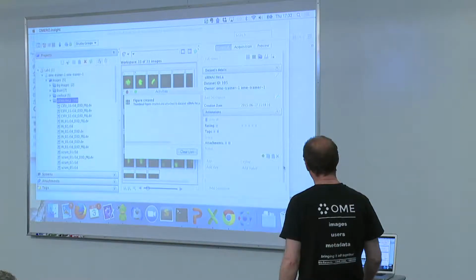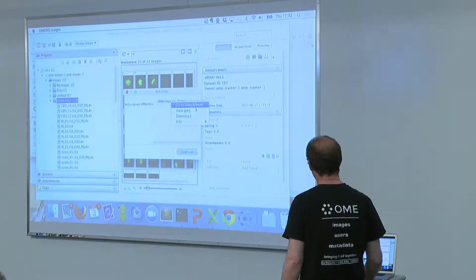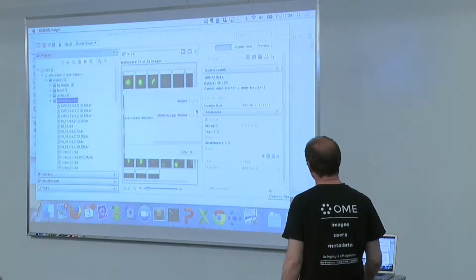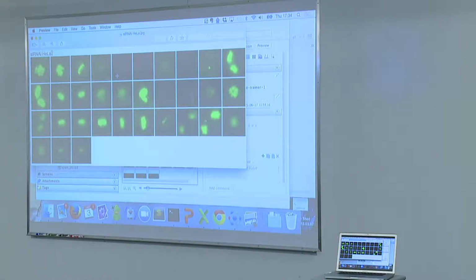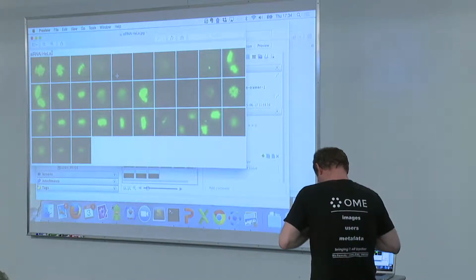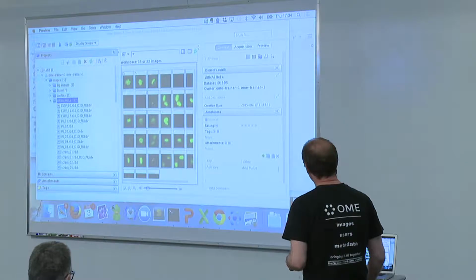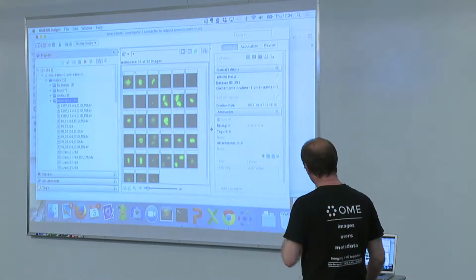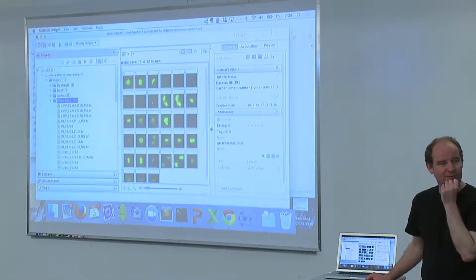Okay, the figure is created, and you can do a couple of things. You can download the attachment to your local machine and show it to your boss. You can view it, of course. Let's do that right now. The other advantage of that script is that you can sort the images according to the tags. So you can spit them out according to the tags.